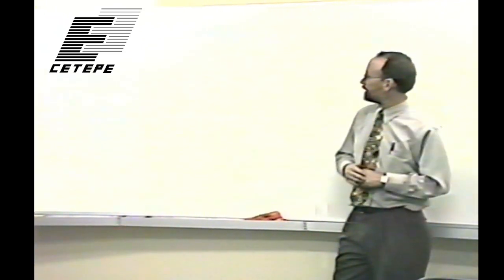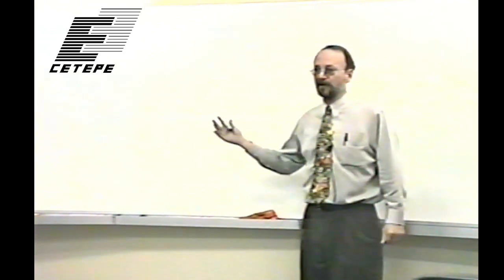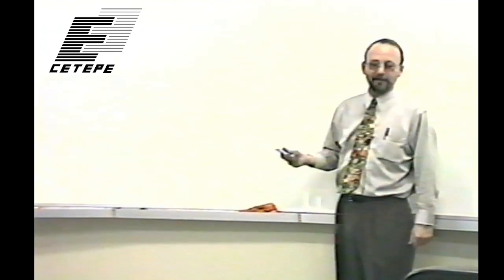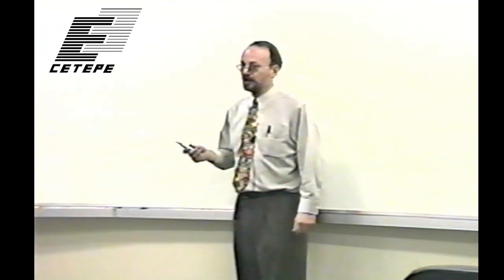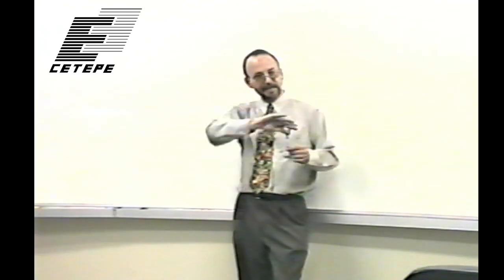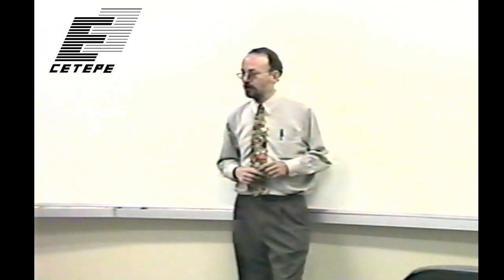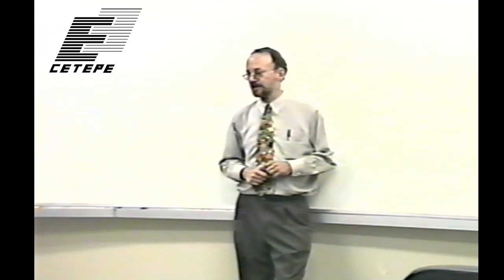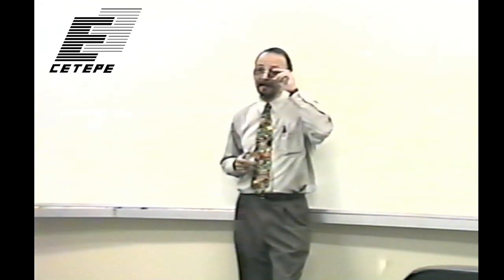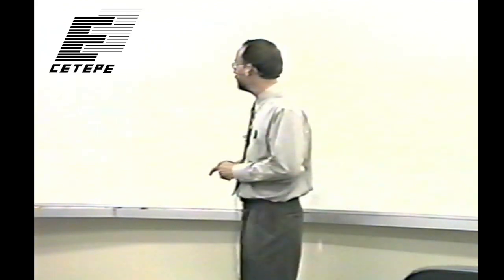So since we're not blessed with monochromatic sources for the most part, unless we use a radioisotope source and we can find the right radioisotope with these two energies, mostly we're confined to laboratory sources, which we've seen have this broad Bremsstrahlung spectrum of X-rays. So what we'd like to do is somehow filter the spectrum to alter it and enhance the radiation in a certain wavelength region.